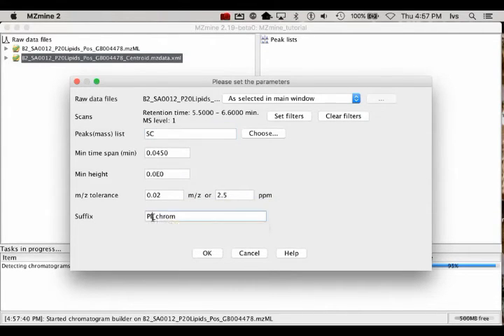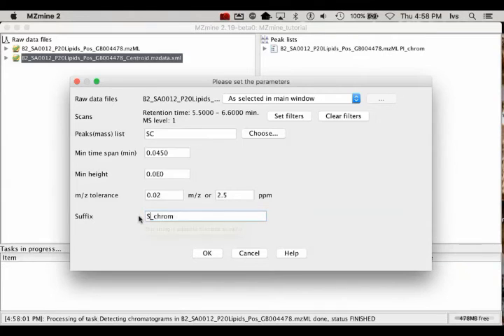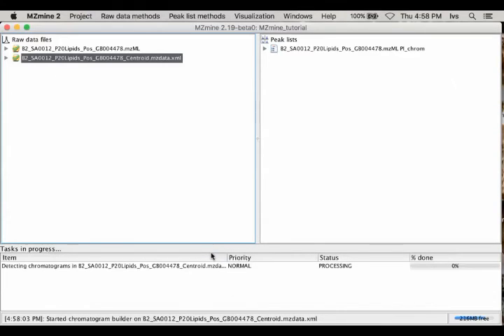Most importantly, the mass tolerance used to distinguish one peak from another must be specified. This mass tolerance parameter can be specified in absolute mass or ppm. This parameter must account for any calibration drift during the run, as well as the inherent instrument resolution and centroiding precision. The mass tolerance setting must be guided by user judgment, often by analysis of the variation seen in the calibration samples run before and after an LCMS run. This process is repeated for the Peak Investigator dataset.